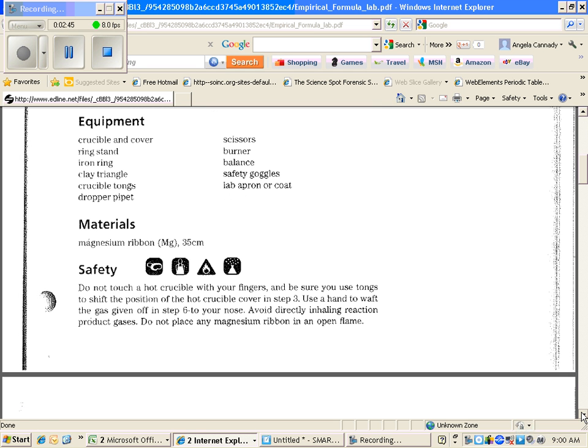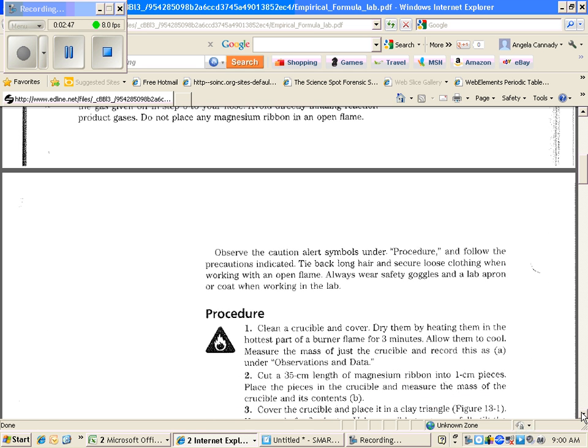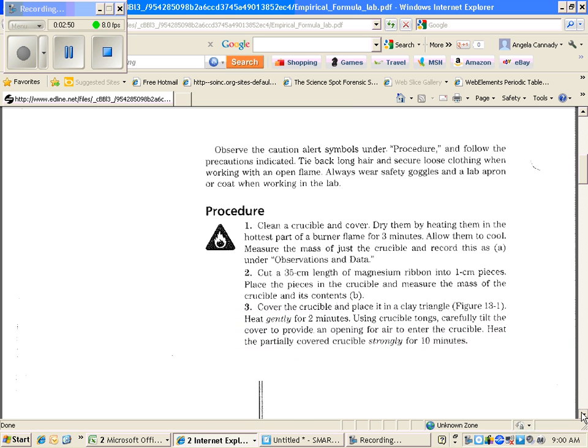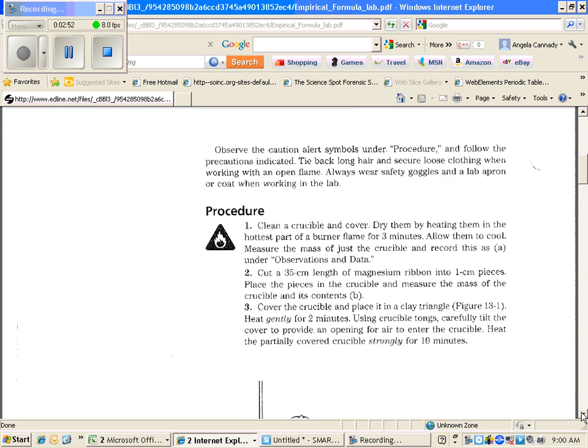You want to be very careful when you touch this. Also, the magnesium ribbon, when it burns, if it catches on fire, it burns in a white hot flame. It looks like a welder's flame. So don't look directly at it if that happens.